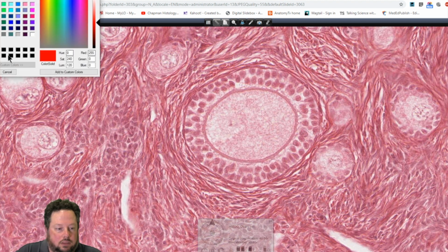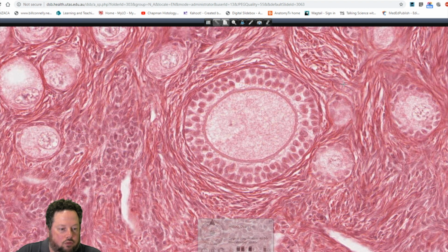Let me see if I can. I'm going to write it with the mouse here. So zona. I'm going to have to get the pencil out, aren't I? Here, it's really gross. All right, so that's the zona pellucida just here.